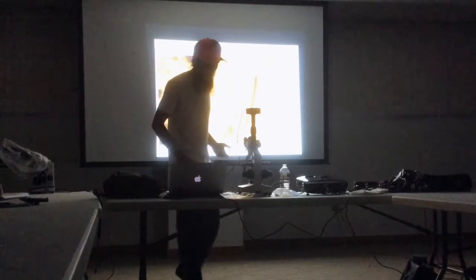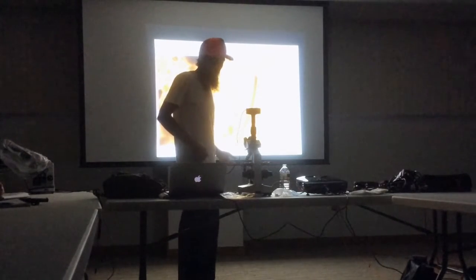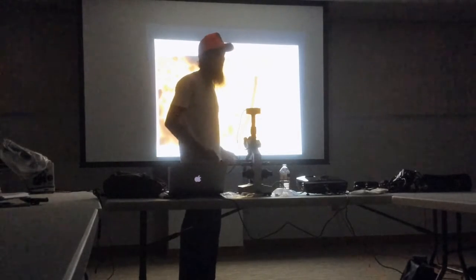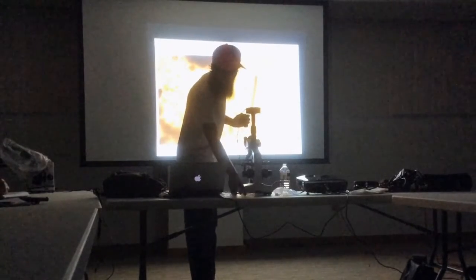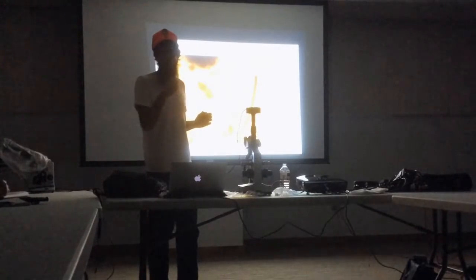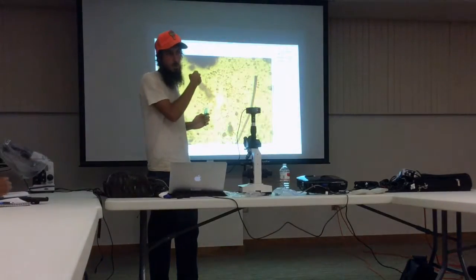Cool, so that was that sample. I've got to clean up some equipment to do the next sample. How do you want to do it? Do you want to all continue to look at these samples and go through the IMO? Sure. Yeah, I like seeing them up there, and you can explain it to us. Okay, so I'll put the IMO up here.